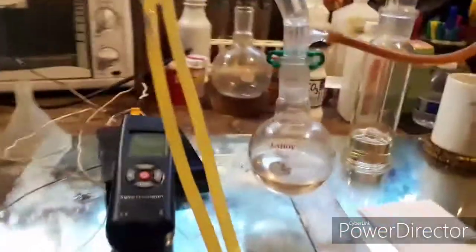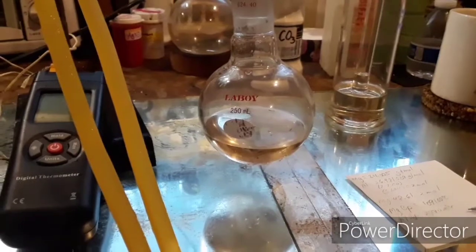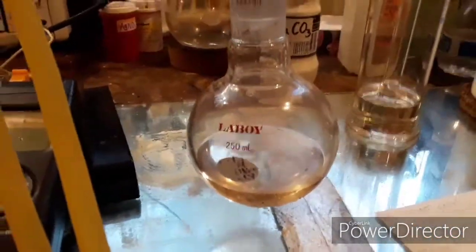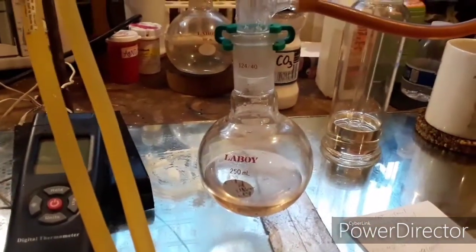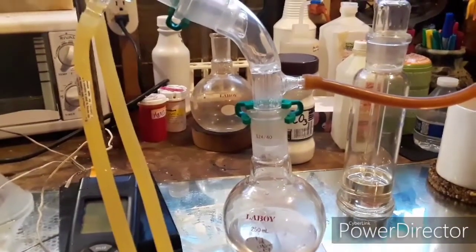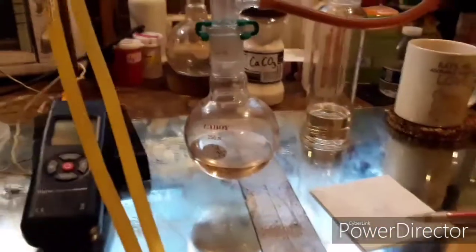What's coming over here should be 98% sulfuric acid. I'll take a density reading once it's all collected, but it looks pretty much like 98% should — it's real syrupy and fairly clear. In my experience, sulfuric acid will get a little darker when it heats up but then clears up nicely as it cools down.